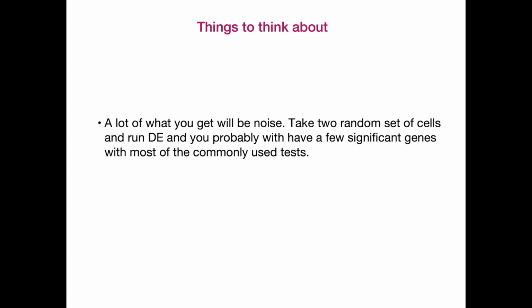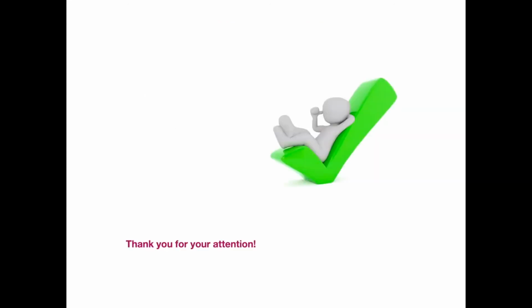And also think about that in most cases, if you take 2 random sets of cells and run one of these tests, there will be a few genes that come up. So really think, is this just noise, or is it an actual biological signal? Do the genes make sense?